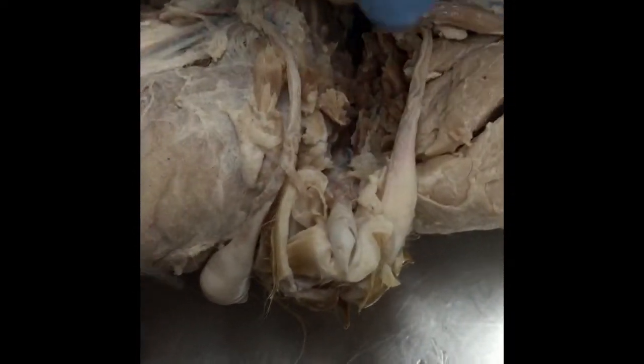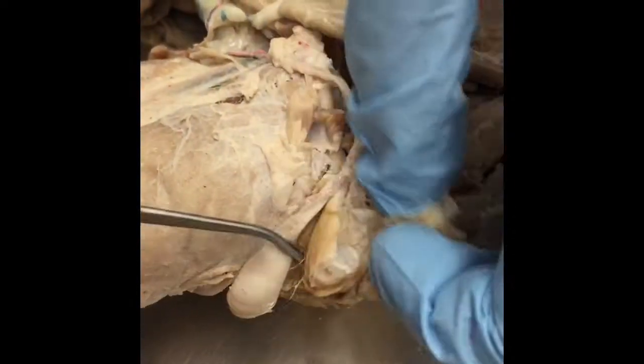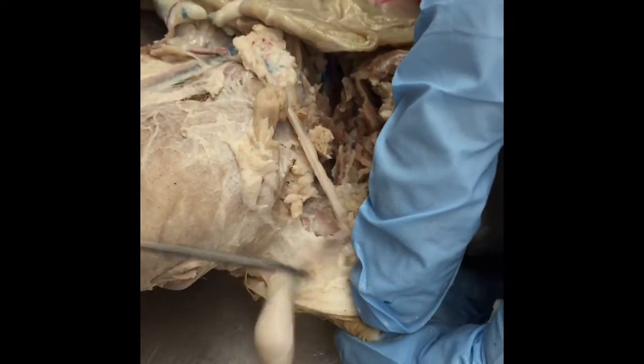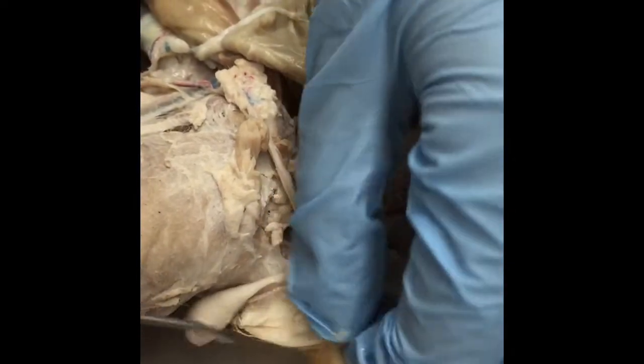Okay. And then we want the balls. We have a male cat. Oh yeah. Okay, so the covering that covered the testes is the scrotum, right? Correct? Yeah.